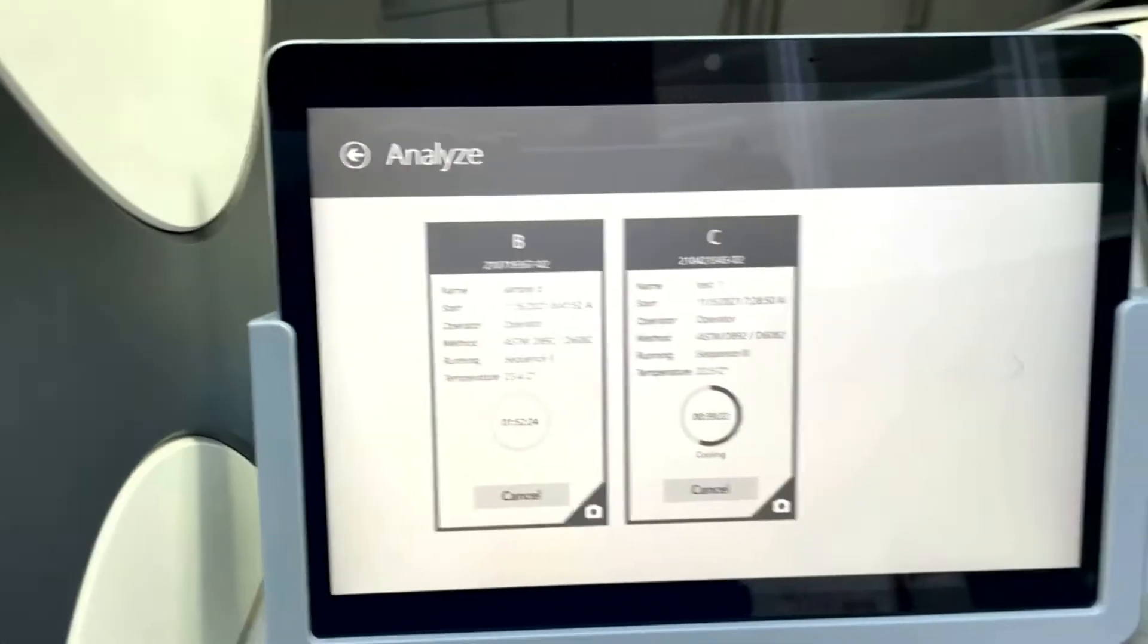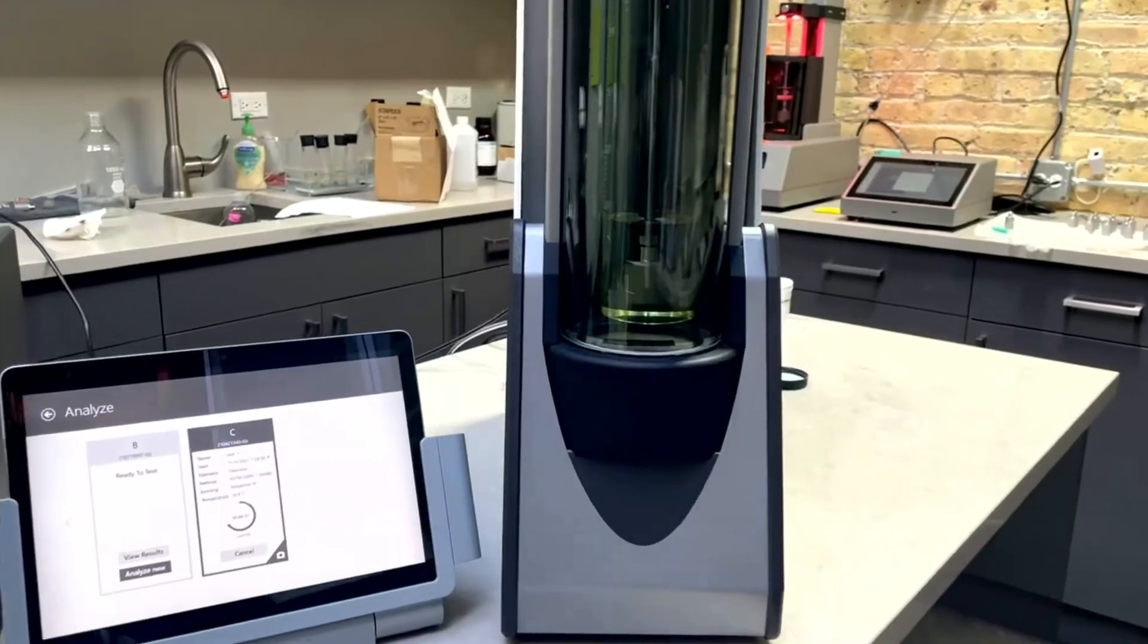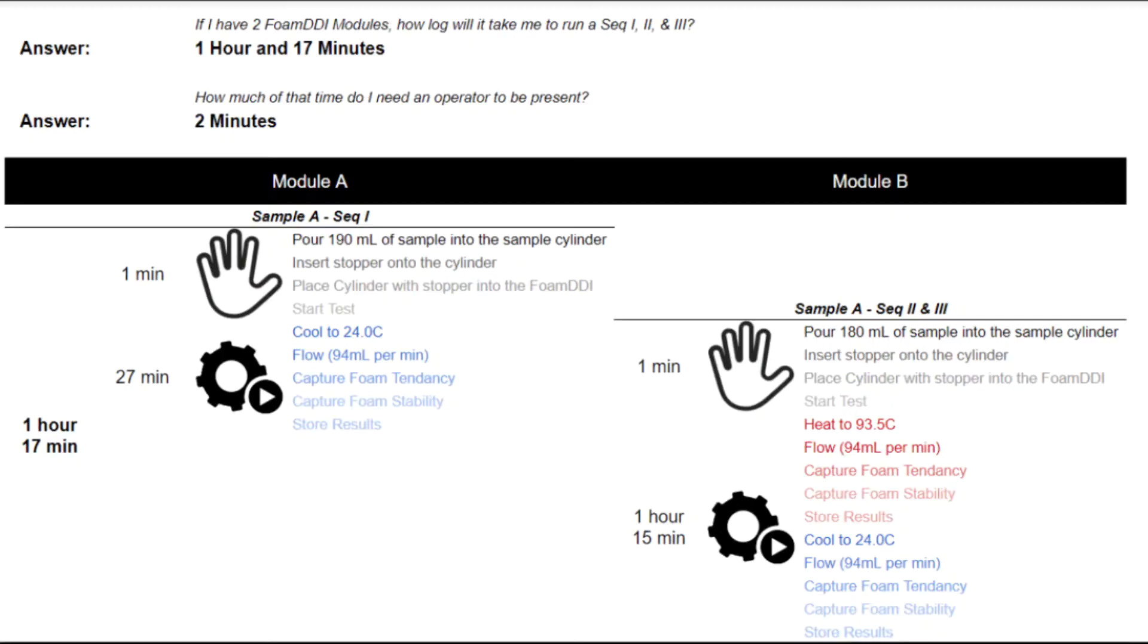You'll see two to three runs showing the amount of throughput we can run in 40 minutes via this timelapse 30 second video.